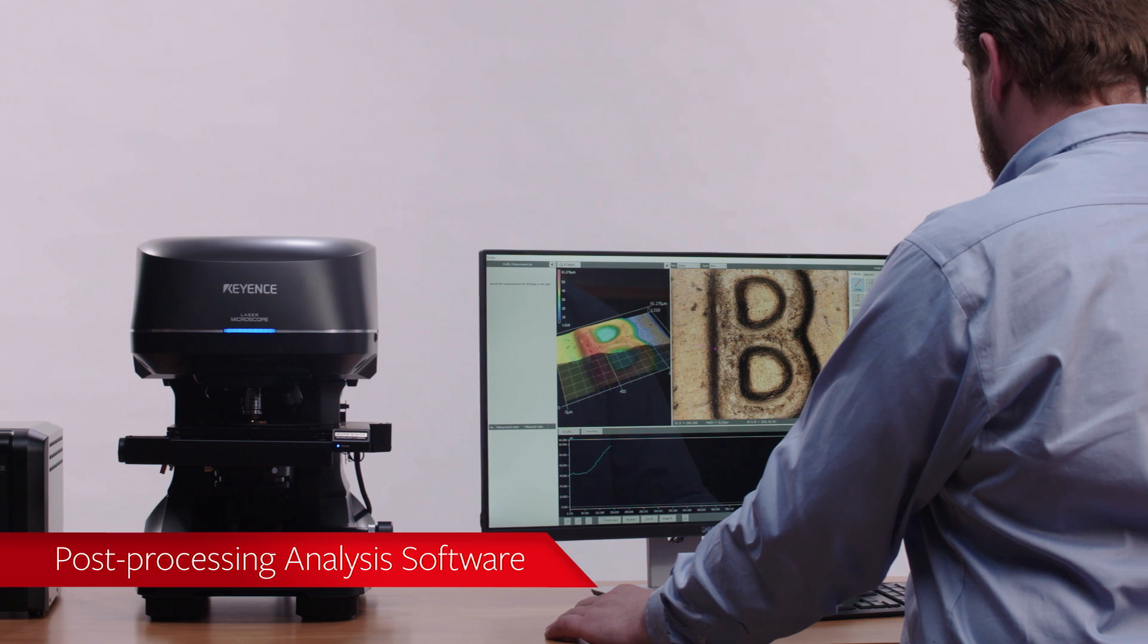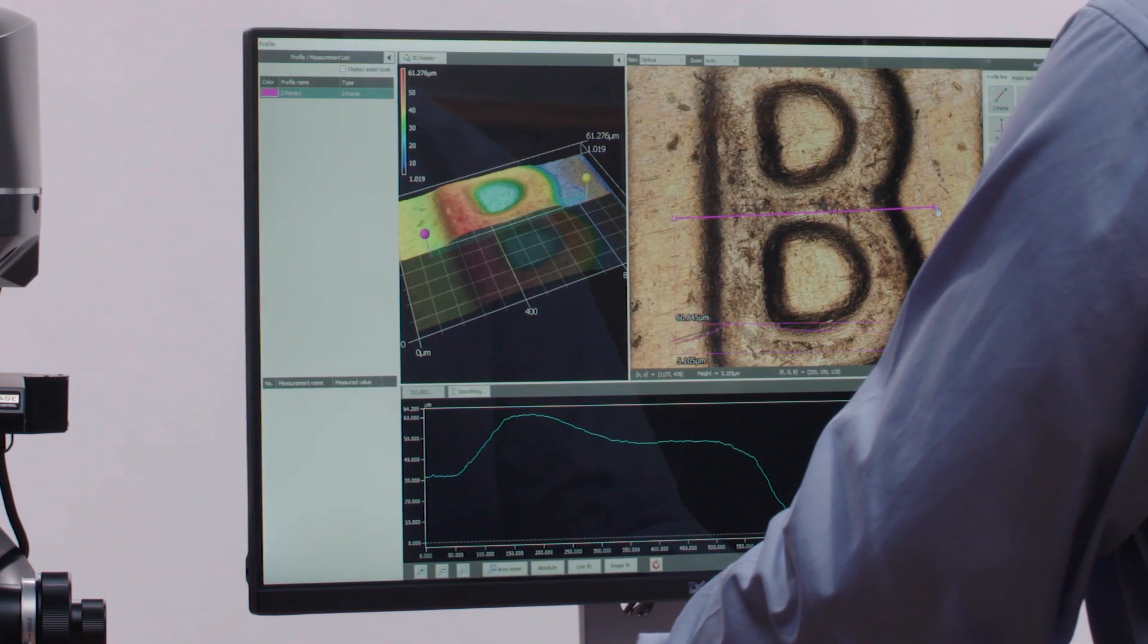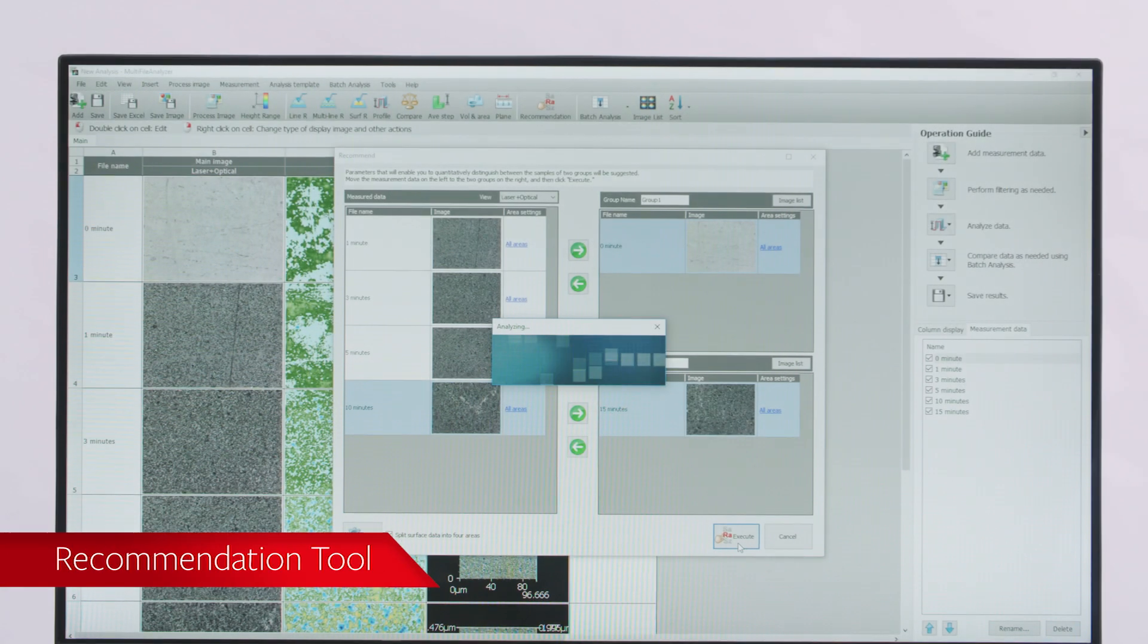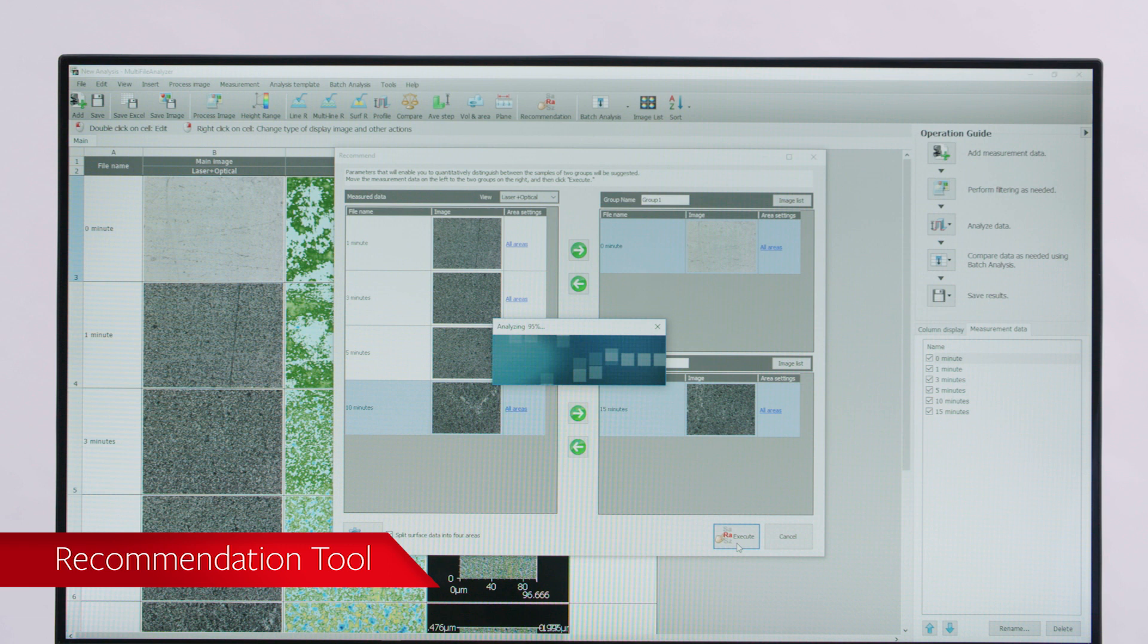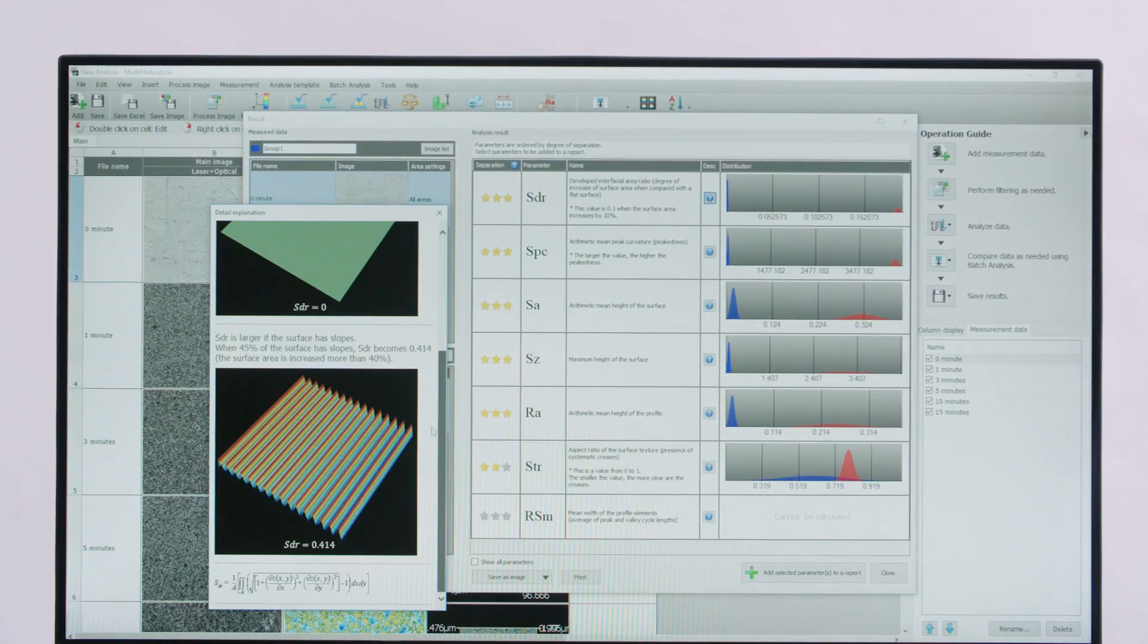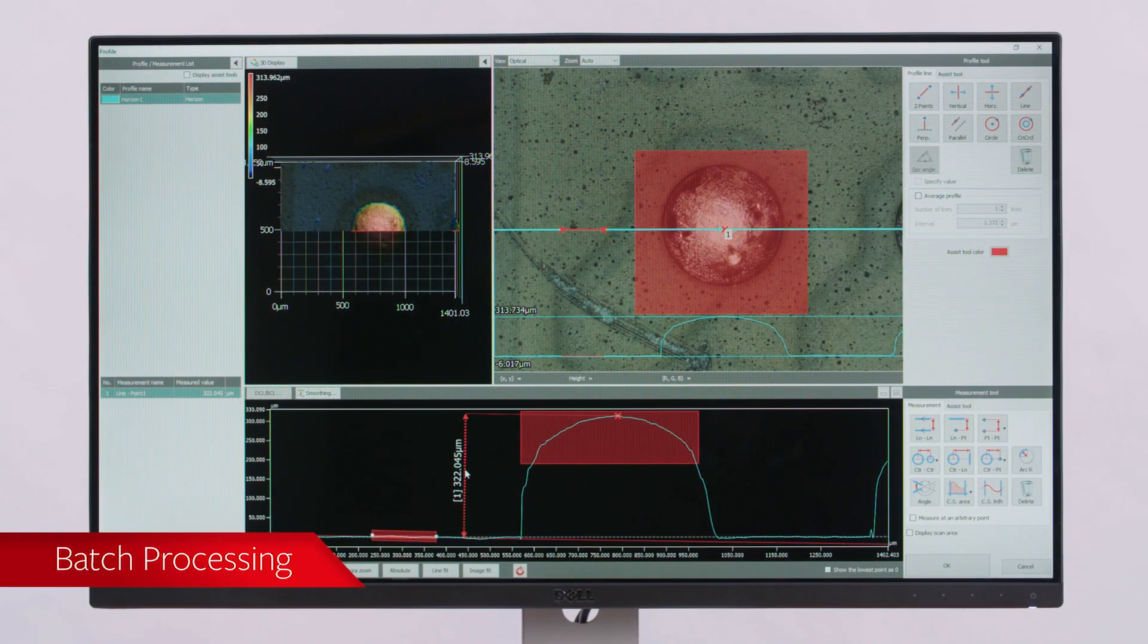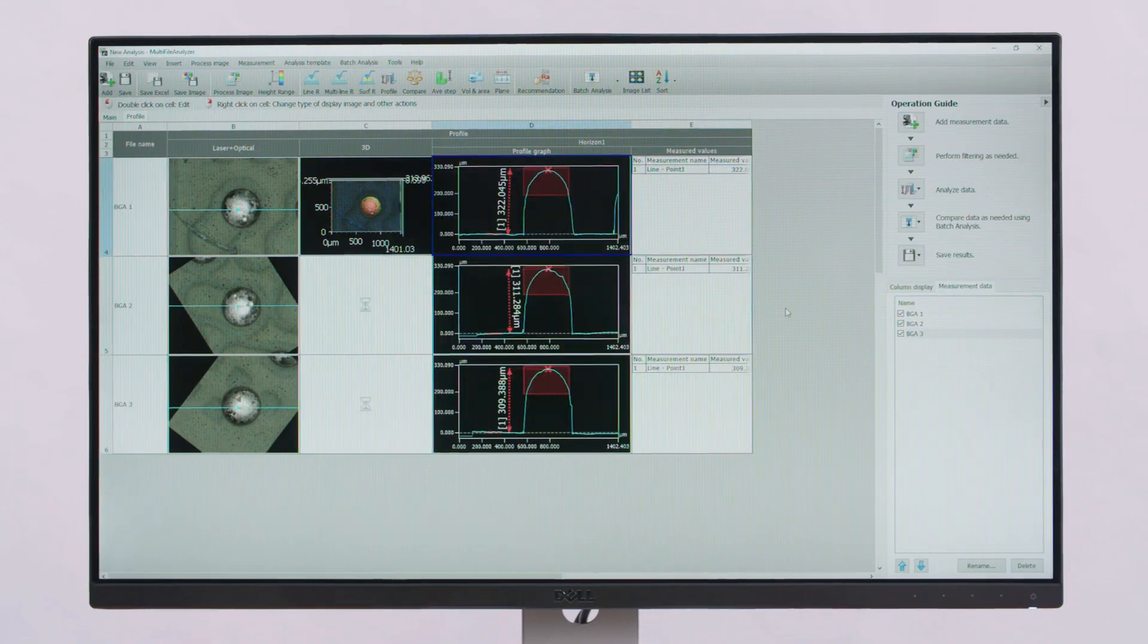The post-processing analysis software provides advanced measurement capabilities, making it easier to tie measurements to decision-making. The recommendation tool compares two samples or sample sets across 42 roughness parameters, providing a clear analysis of how two samples differ. Batch processing promotes measurement across many parts, saving time and increasing repeatability.